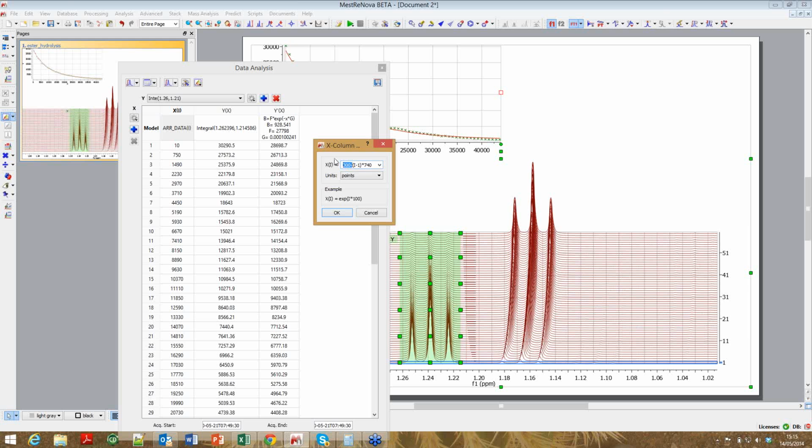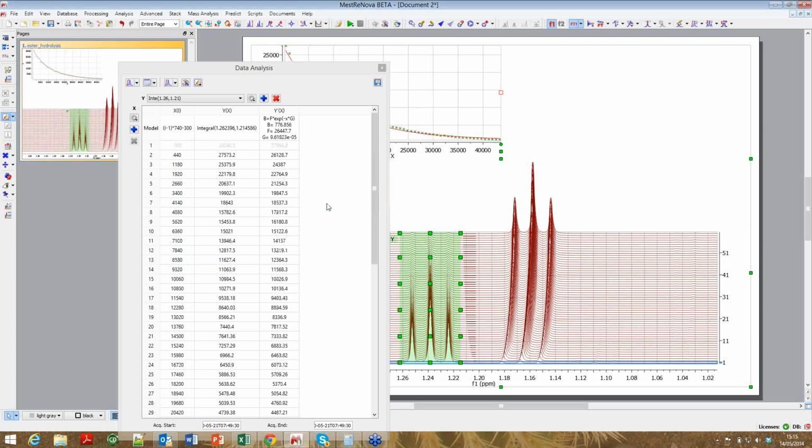Let's see, I should put minus 300 at the end, shouldn't I? Let's try that. There we go.